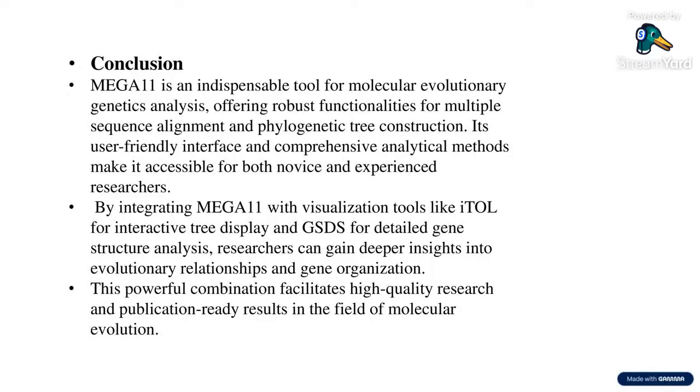Okay, I will tell you again. Codon-based analysis in Mega 11 basically focuses on nucleotide substitution at the codon level, rather than simple amino acid analysis, like silent or amino acid changing mutations.